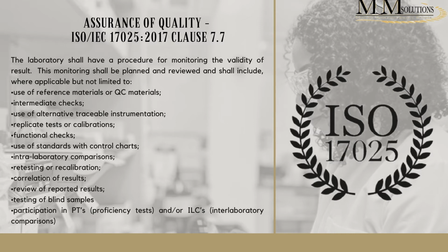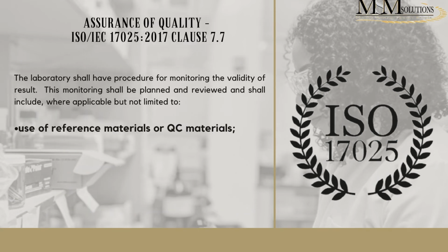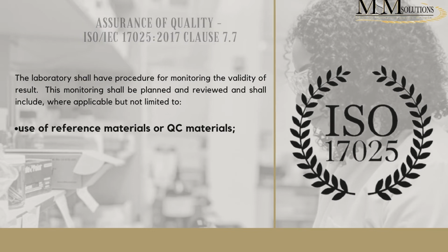It says that the laboratory shall have a procedure to monitor the validity of results. This monitoring shall be planned and reviewed and shall include, where applicable but not limited to, different activities. It then lists different activities that a laboratory can do to monitor its activities. We will focus mainly on the first listed activity, which is the use of reference material, or what we normally would refer to as QC material.